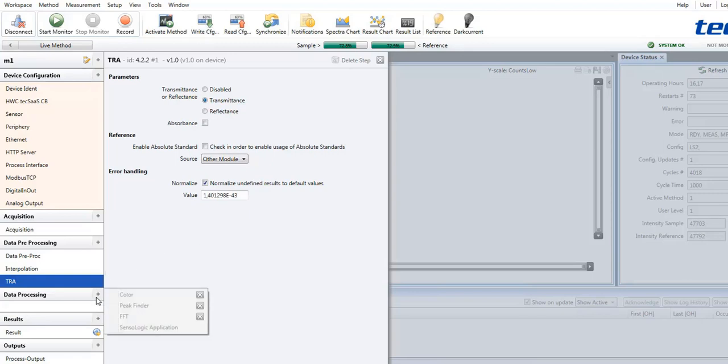In addition, depending on the license purchased, other data evaluation steps are available for selection. This is for example colorimetry, a peak finder, an FFT or chemometric processing.